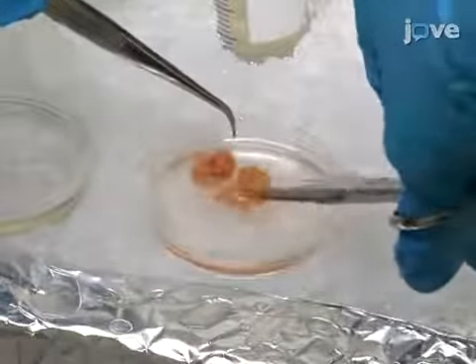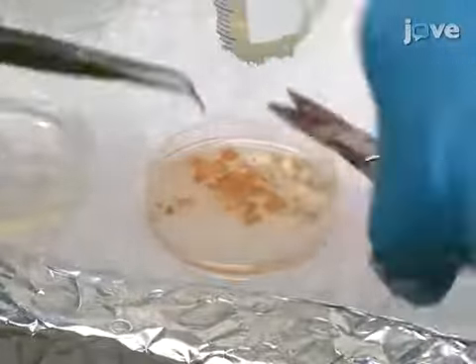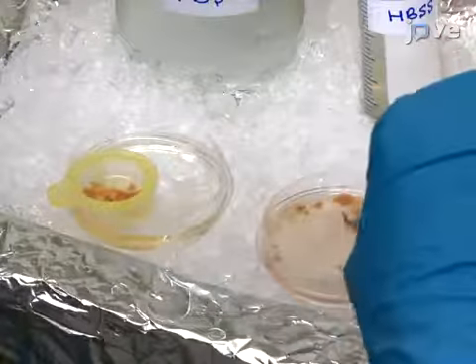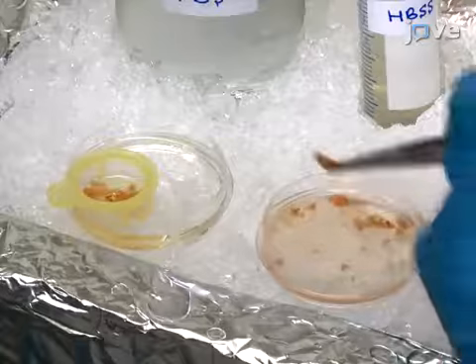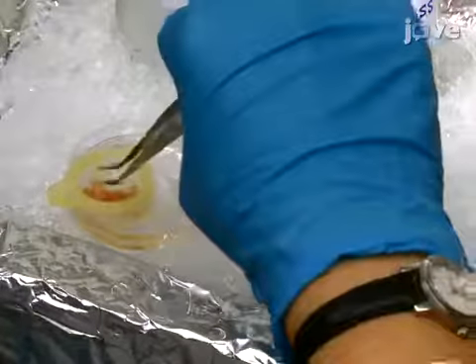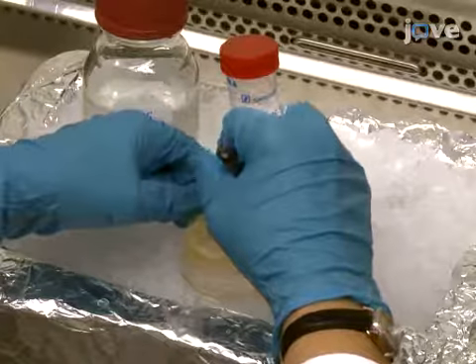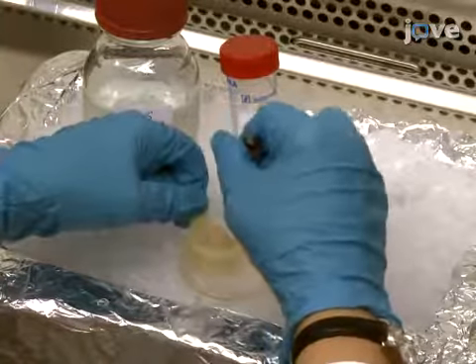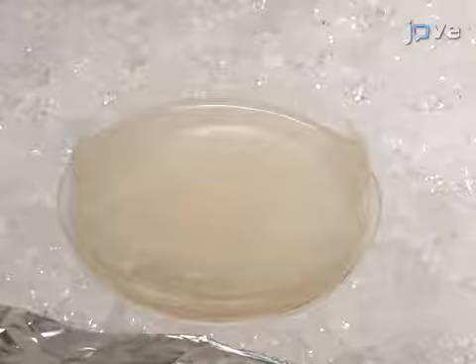Next, cut the tonsil tissue clump into 3 to 10 millimeter fragments, followed by transfer of the fragments into a 100 micrometer plastic cell strainer in a new 60 millimeter cell culture plate containing 10 milliliters of fresh HBSS with supplements. Using the plunger end of a plastic syringe, smoothly squeeze the tissue fragments through the cell strainer, making sure that the tonsil fragments remain totally immersed in the HBSS.